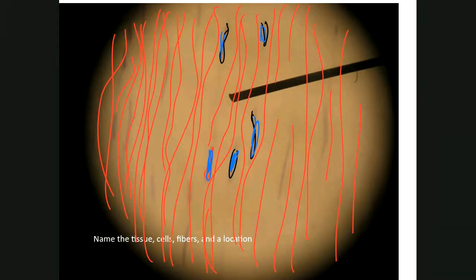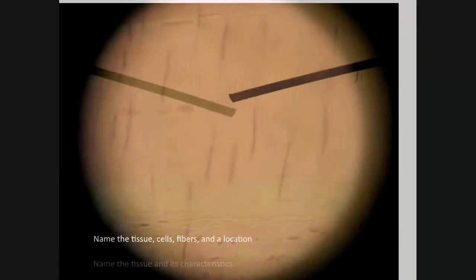Okay. So that's just a side note there. Just be aware of that. Very hard tissue to identify. Next one, however, is very easy.